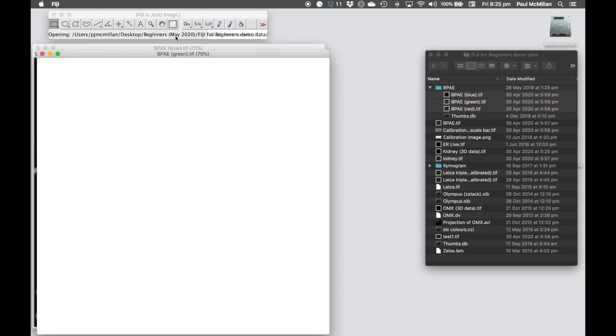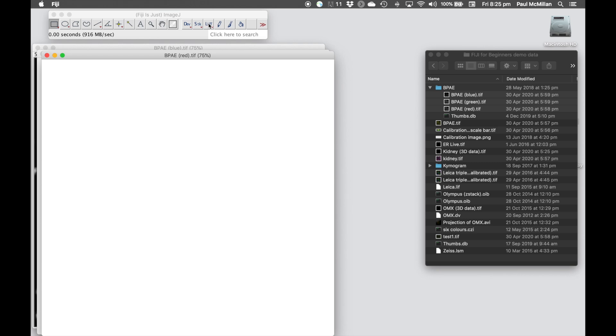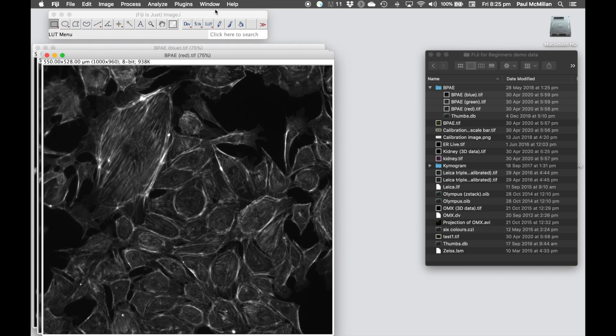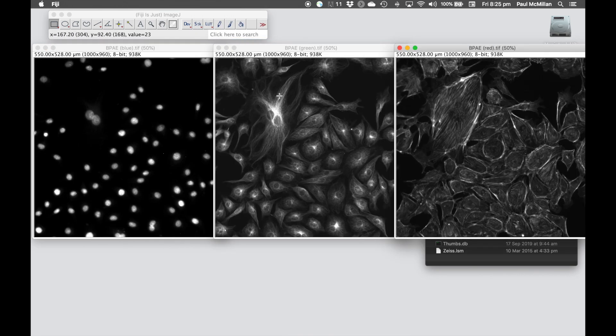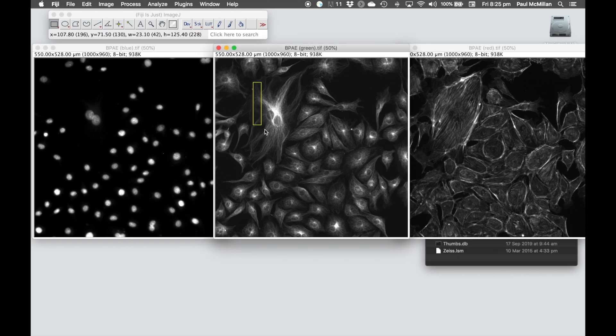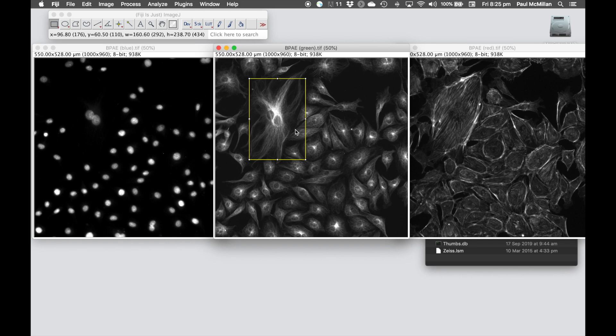We've got the blue, the green and the red channel. In this example, let's draw a region of interest over this cell here, and we want to apply the same region of interest onto the other channels to allow us to crop those and make those into a panel.